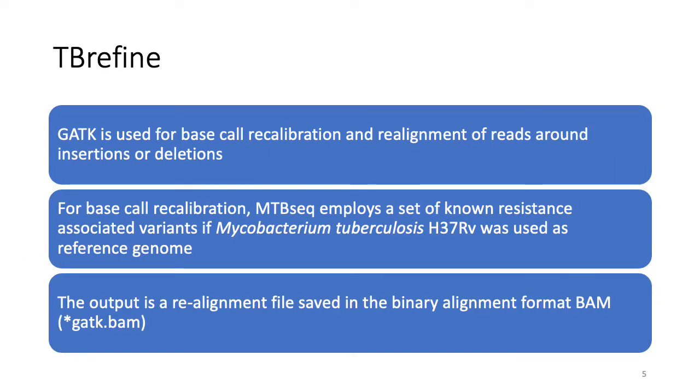The next step is TBrefine, and in this step, the GATK is used for base call recalibration and realignment of the reads around insertions and deletions relative to the reference genome. In such regions, generally, we wish to see our reads mapped with one end of the read on one side of the indel and the rest mapped on the other side.